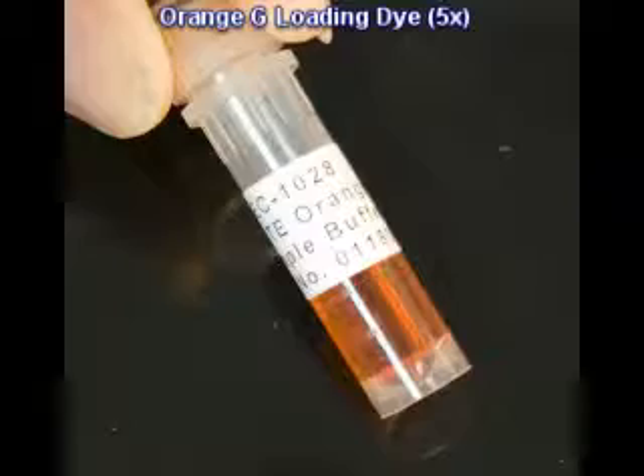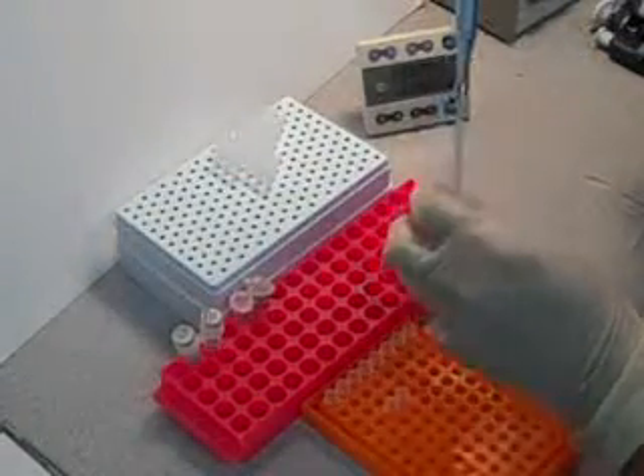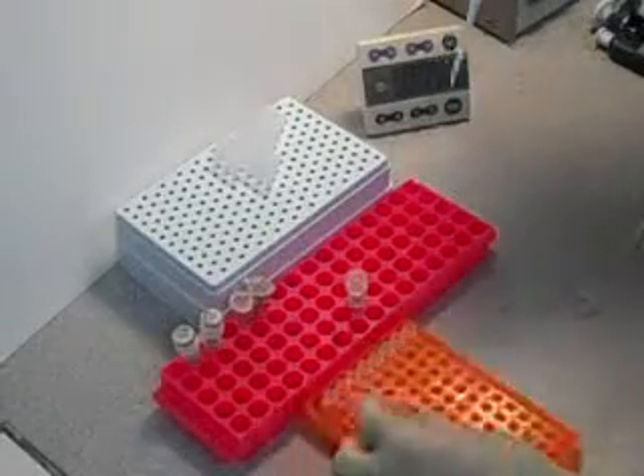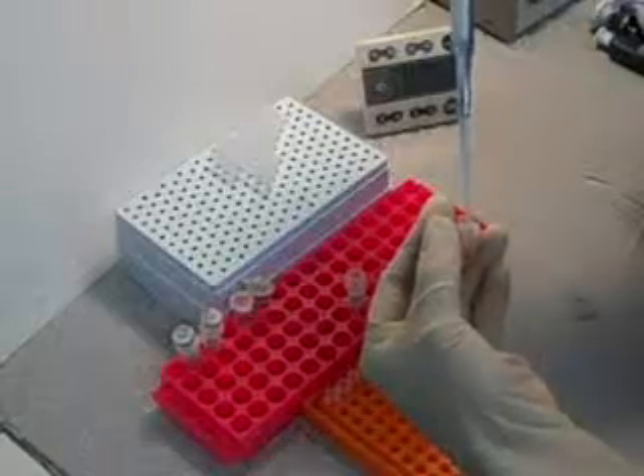Then add the loading dye into the mixture. We are using 5X Orange G dye and adding a volume that is one-fifth of the total volume to the mixture. Mix it thoroughly.